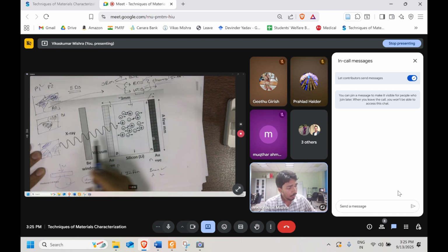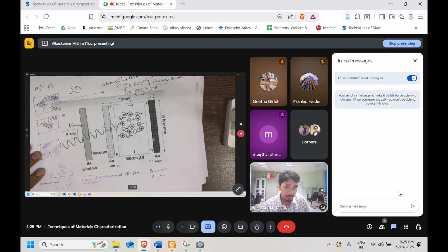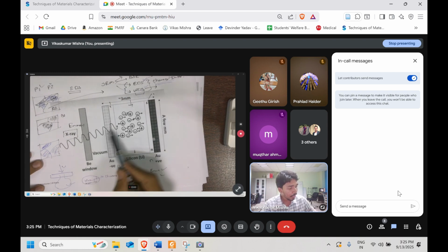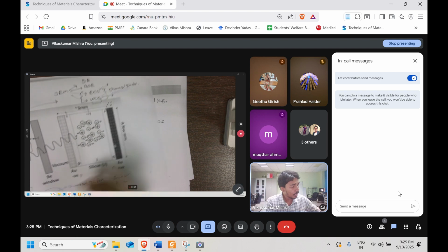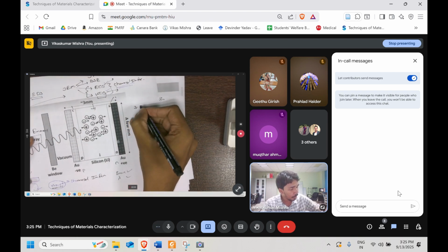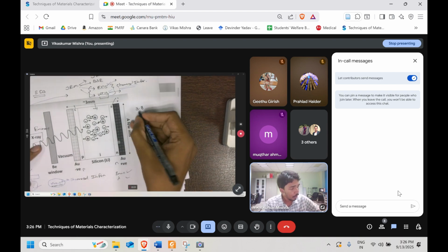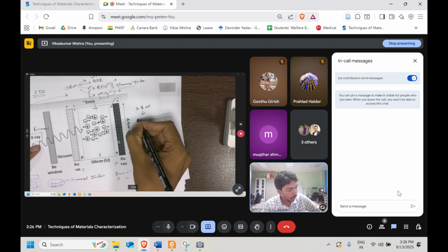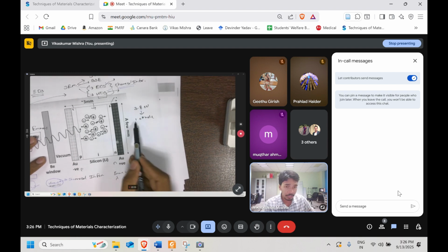Now, the X-ray has a certain particular amount of energy, specific energy, because we know that the characteristic X-ray has been generated, and that X-ray will go over here. Once it interacts with this particular semiconductor, this detector, which is made up of silicon, what will it do? We have learned in the class that the band gap is around 3.8, I think. Please check the value exactly, I don't remember. Yeah, it's correct. So this much electron volt is needed to create one electron hole pair.